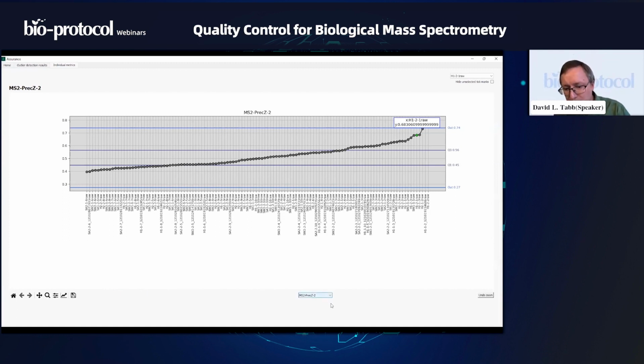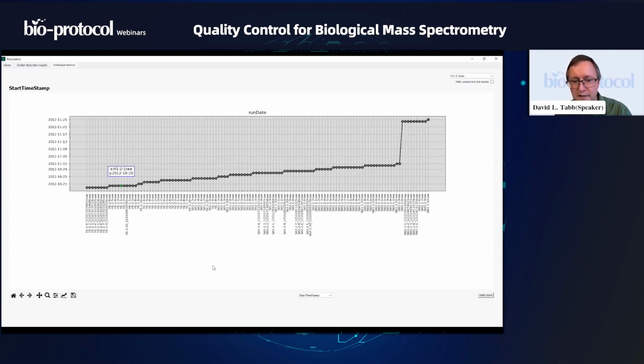But I wanted to show you a little bit of snooping that we did on the people who ran these data for us. You see, their raw file names don't really tell us much about when they were run. So they just gave us back files that were labeled H1, blah, blah, blah, H2, blah, blah, blah, SA1, da, da, da, SW1, that sort of thing.